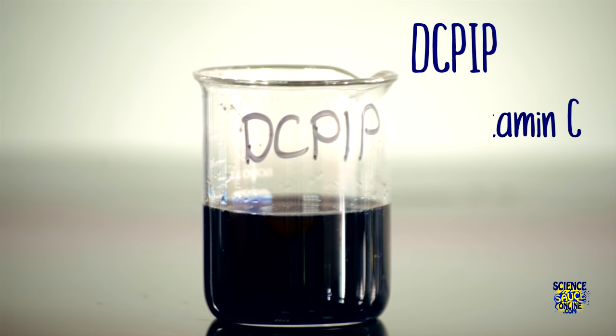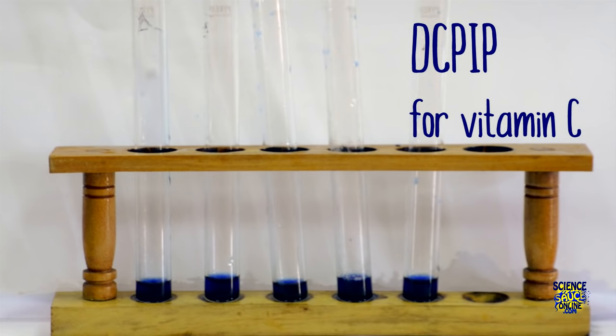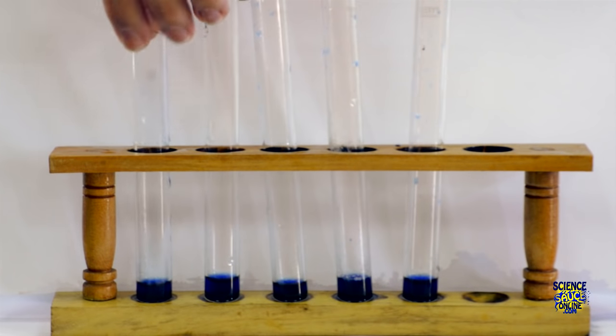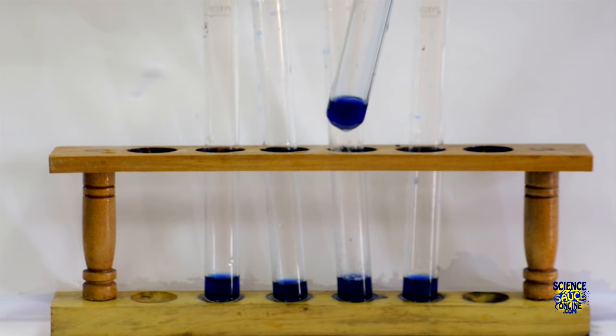We use DC-PIP to test for the presence of vitamin C. Fill your test tubes up with DC-PIP without your samples present in them. Then add your samples into it drops at a time and shake as you're doing it.